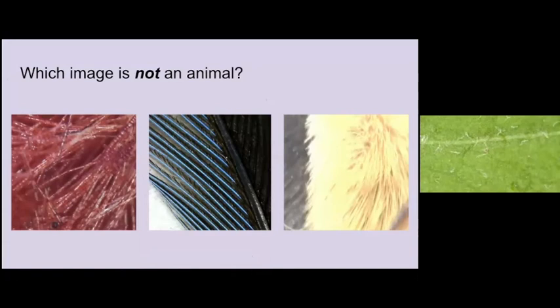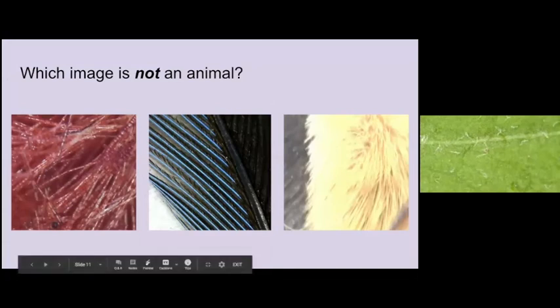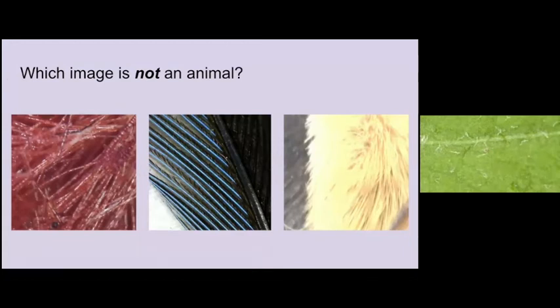Oh, I think I see a hand from Fern. I see lights, I see lights. I think it's the first one, because it's scratchy, it looks like a gem, and it's not really animal-y. But what about the second one? It looks not animal-y. What does the second one look like to you?